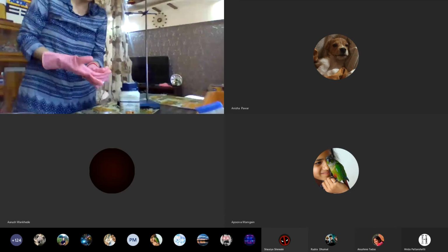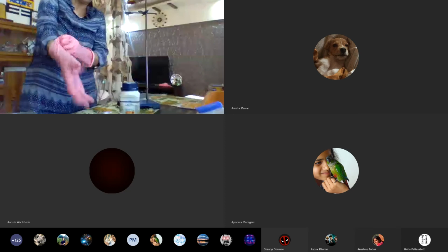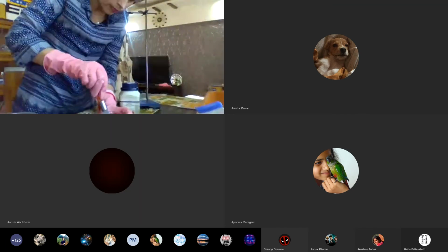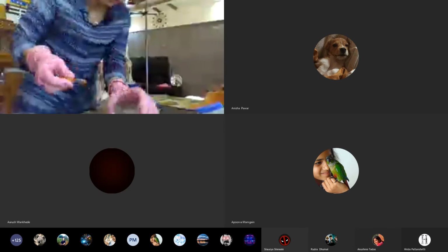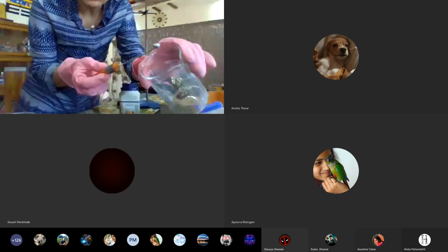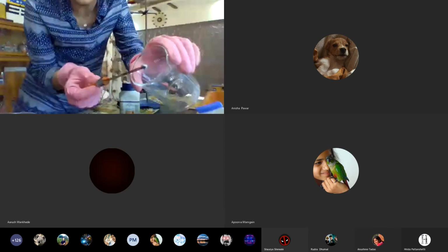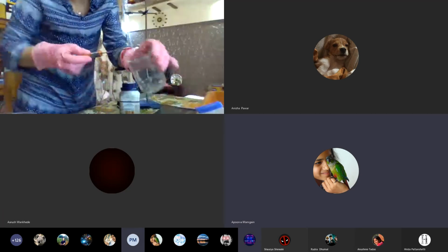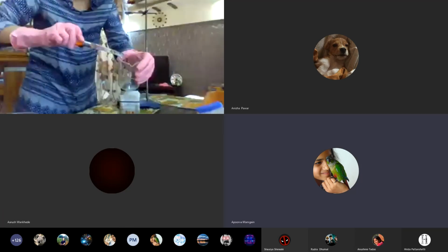So I'm going to take someone's help also in between. Let me show you this sodium. I can cut it using a knife. It is a very soft metal. Can you see the sodium? It's on my knife. Yes, ma'am.